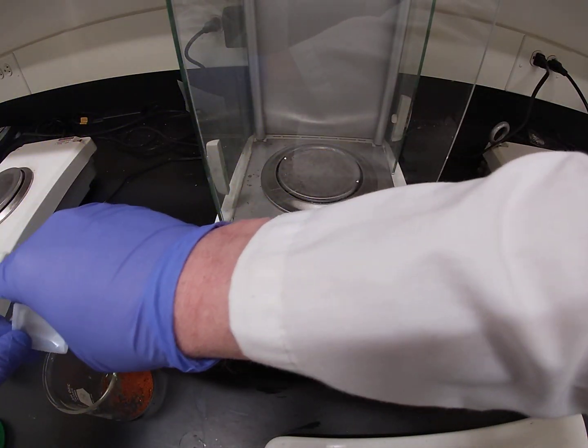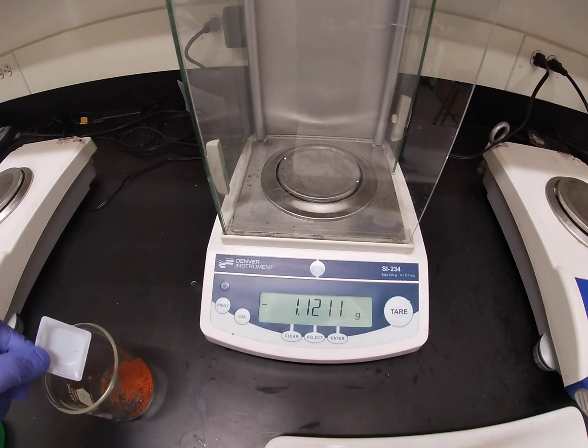We'll dump that into the beaker and rinse out the weigh boat when we get out front.